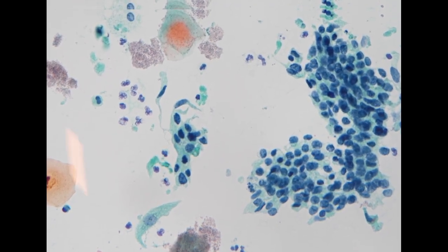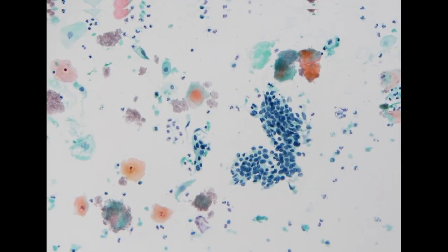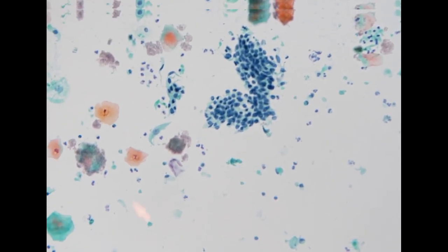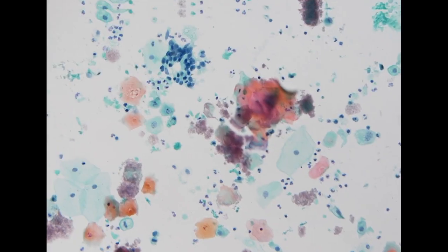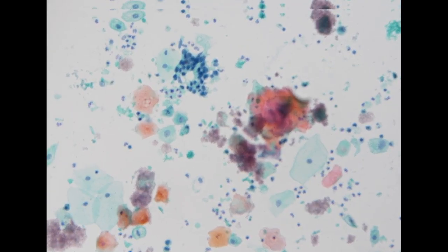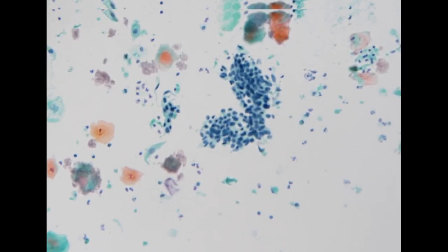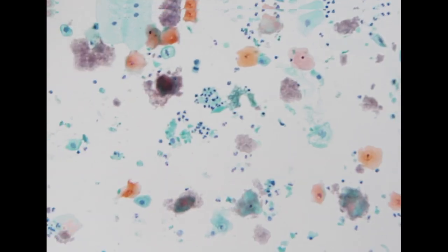So based on the morphological pattern, this is suspicious for high-grade urothelial carcinoma, and likely there was focal squamous differentiation. Squamous differentiation can account for up to 30% of high-grade urothelial carcinoma. So it is not uncommon that we can see high-grade UC with focal squamous differentiation. These are quite obvious. The urine was initially screened as negative. So this is the cell that we want to look for in the voided urine specimen.